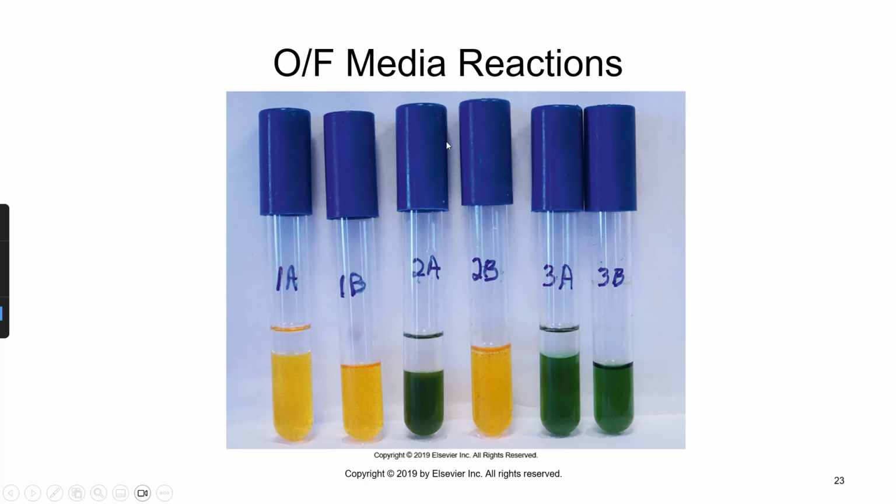In this next set, we see that the aerobe is positive and the anaerobe is negative. So it is an obligate aerobe. It cannot undergo the process of fermentation in the absence of oxygen. And this one may be asaccharidic. Maybe it's a non-oxidizer. It's not able to utilize that type of sugar, because both of these are negative.